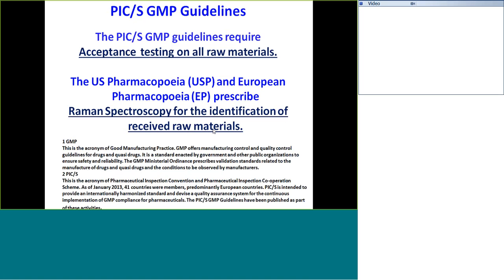They pick the wrong components, the wrong bag, and then make totally counterfeit drugs, so they cannot be sold at all. And so in the US and in all the European countries, drug companies are using Raman as a detector to identify those. That's because Raman has this unique chemistry, molecular fingerprints, so it allows us to very easily identify what that ingredient is.